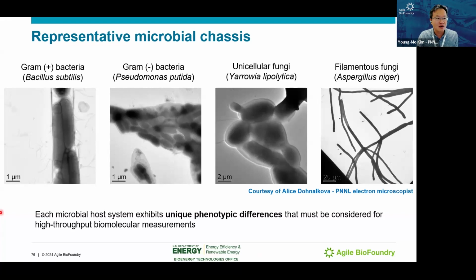The left one is gram-positive Bacillus subtilis, and we see its rod shape. The second picture is Pseudomonas putida, and we see the scale bar. We see that the Bacillus is longer than putida, and we can even see some EPS, extracellular polymeric substances, usually secreted by bacteria, which can make a biofilm. So we can even see their presence or absence by electron microscope.